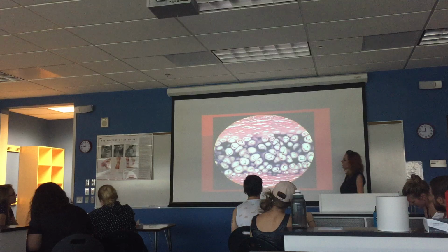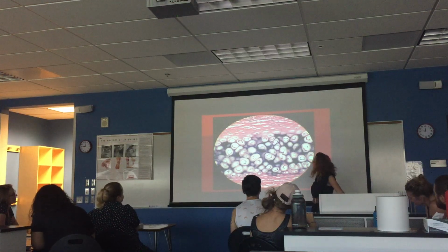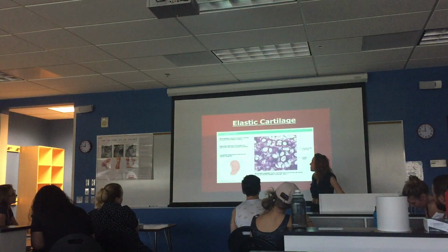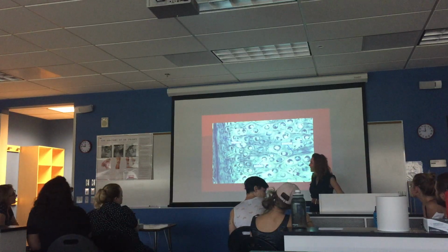These guys are kind of cool. They always look like little creeper eyeballs looking at me though. This is another time for me to tell you that in our lab, we have multiple slides, so they're not always stained the exact same. They're not always made by the same company, and so forth. They're not always from the same critter. Maybe it came from a guinea pig versus a rat versus a monkey or whatever. Sometimes they're different.